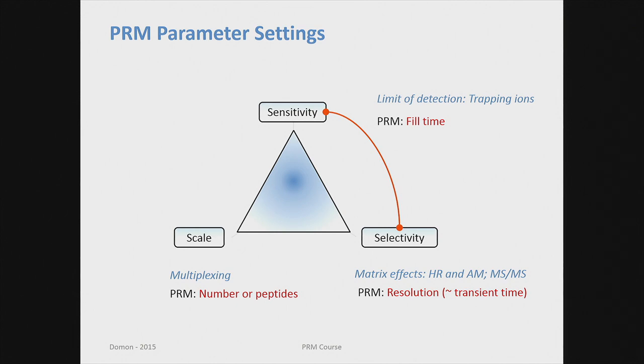So how do I control that? And remember, that's why I spent some time before to show you those two layers. You collect the fragment ions here, and then you pass them and you measure the MS-MS with the other one. So the most efficient way is if these events have equal time, so you perfectly synchronize them and you have the best duty cycle.